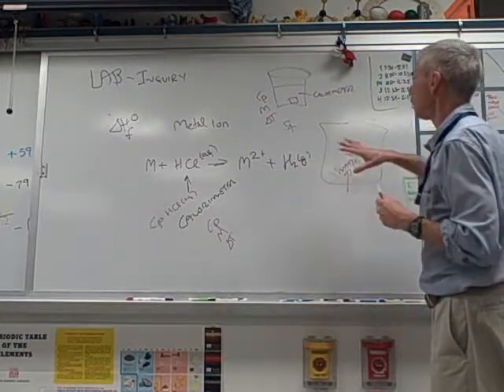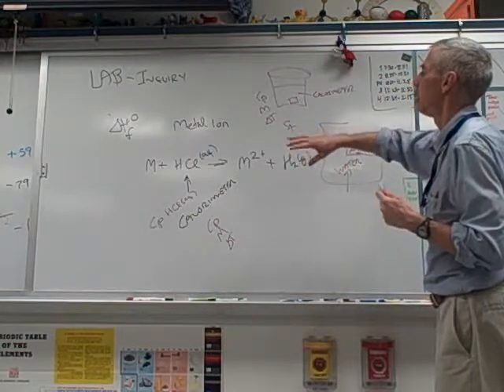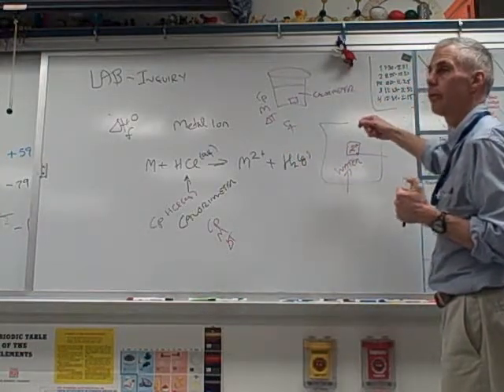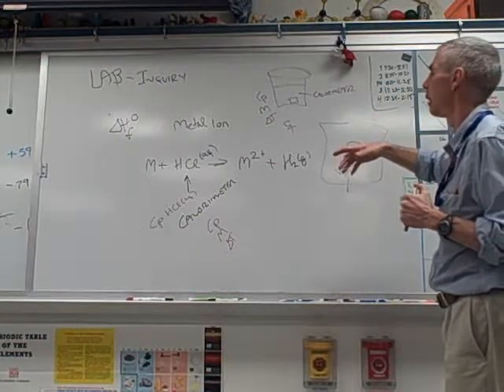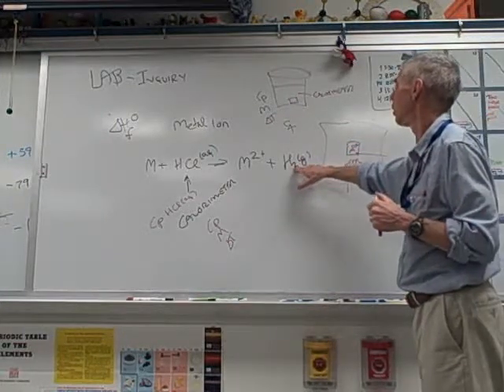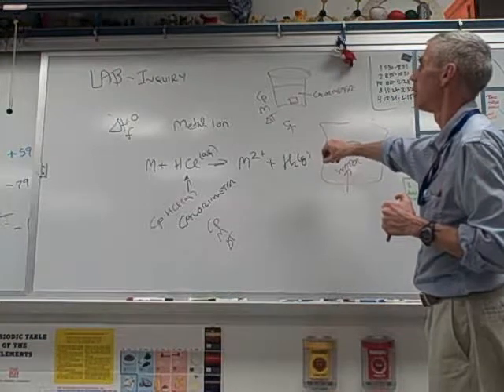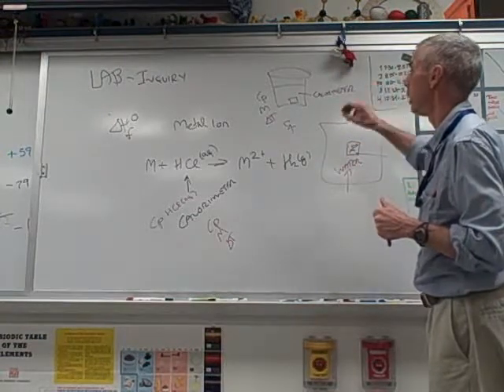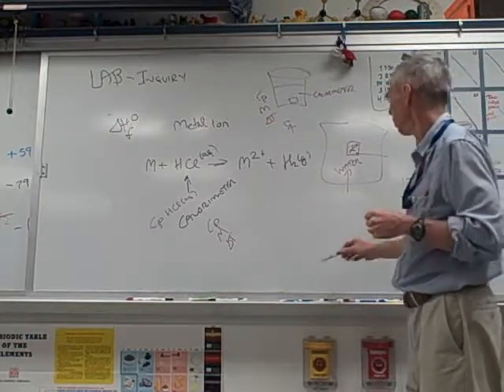Okay. Now, cautions with this one, you will be using fairly strong acid, but the acid does not react with styrofoam, so you're fine there. So you can do the exact same methodology as you have in the past. Think about what the delta HF naught is for each of the things in here if you want to try to figure it out. Use your logic a little bit, and you'll find that it'll fall into place very nicely. Okay, any questions on the lab?